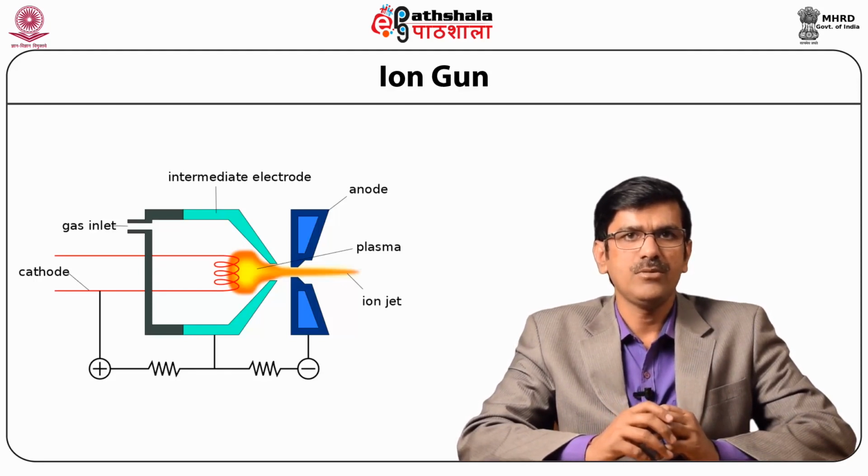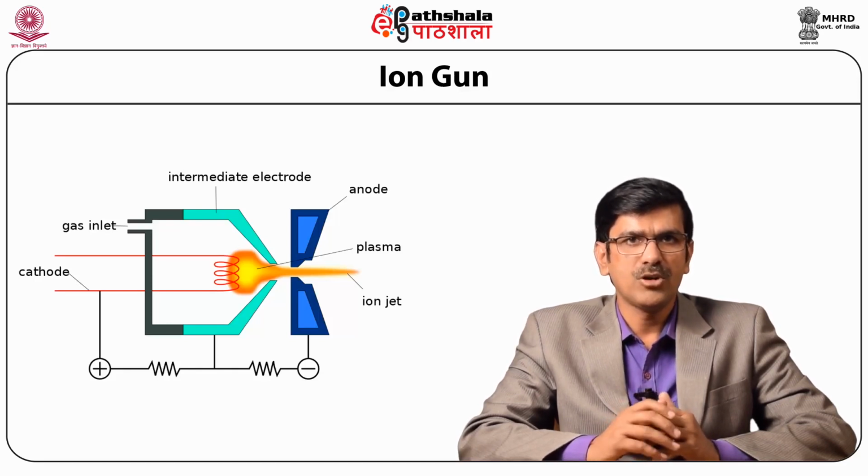These sources are available in a range of spot sizes varying from 2 mm to 5 micrometer. A small size 2 mm ion source provides 80 microampere ion current with a field of view of approximately 15 mm, which is better than the 5 micrometer source, which has 5 microampere ion current and a 2 mm field of view.